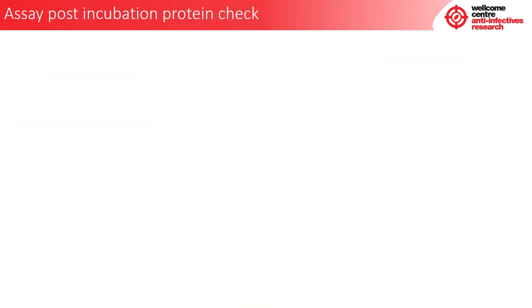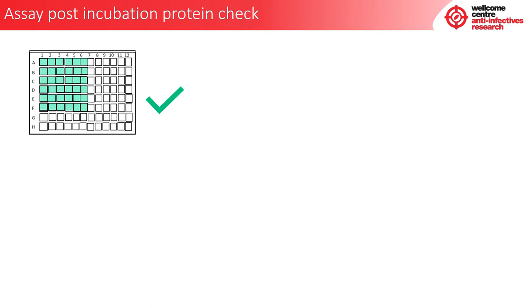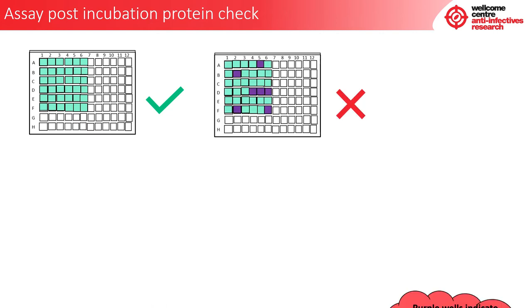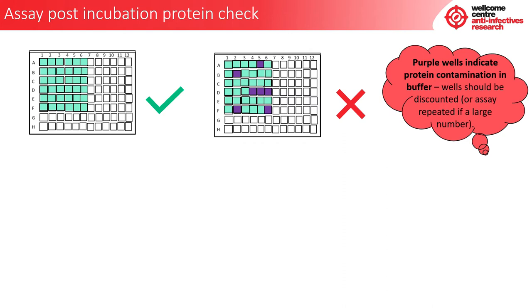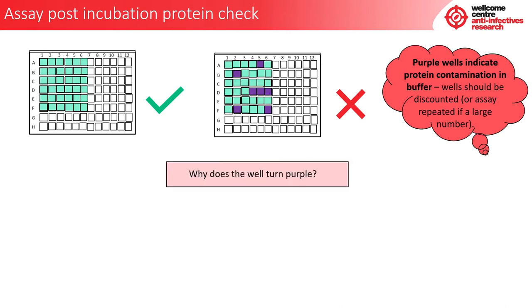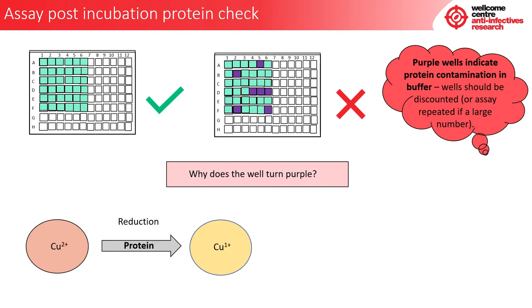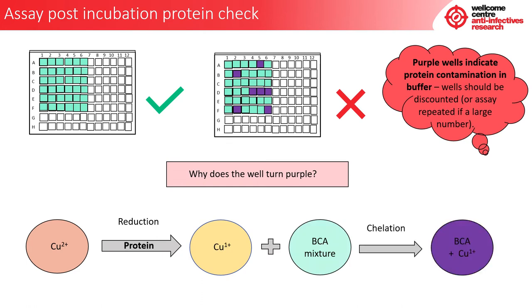After 15 minutes, if all wells are green then the protein check is good. However, if there are purple wells, this can indicate protein contamination in the buffer. These wells should be discounted, or the assay repeated if there are a large number of purple wells. The copper ion is reduced in the presence of protein to the cuprous cation, which when mixed with the BCA mixture undergoes chelation resulting in a purple colour. Therefore, the more protein present, the darker the purple colour. This can also be quantified using the quantitative protein check.